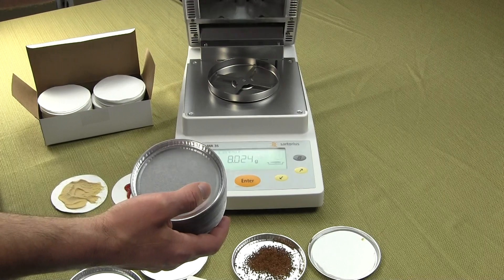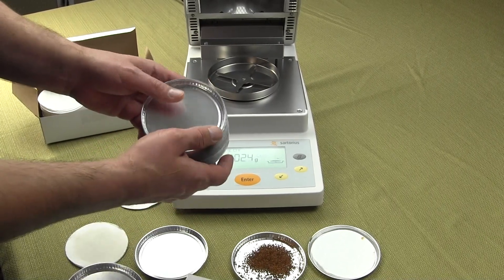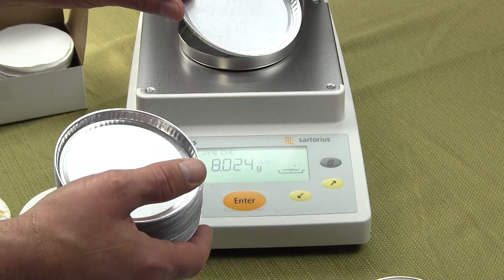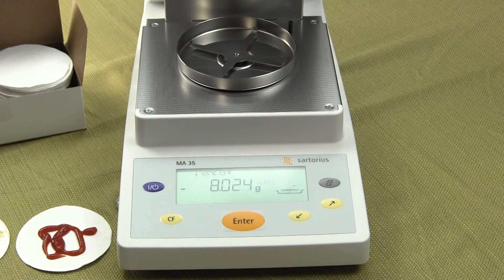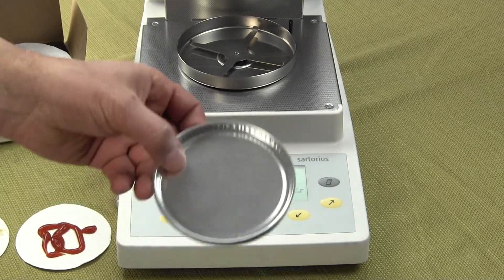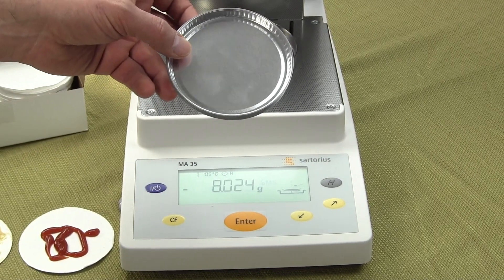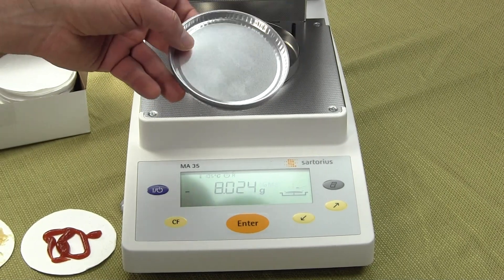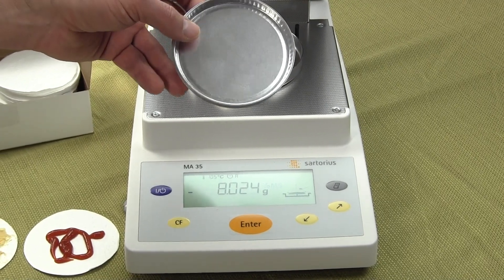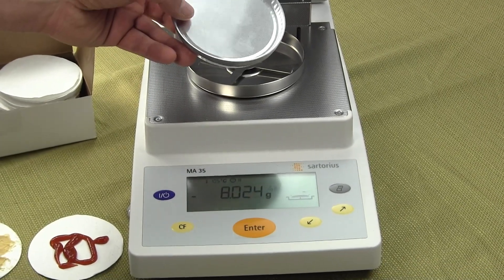We're showing you a Sartorius MA35 moisture balance and we're just trying to show you the consumables. These aluminum pans should never be reused — they are basically disposable and every test you run you should be using a new aluminum moisture pan. These oil-free aluminum pans can handle heat up to 1,250 degrees Fahrenheit, so they can handle really any temperature for any of the moisture balances on the market today.